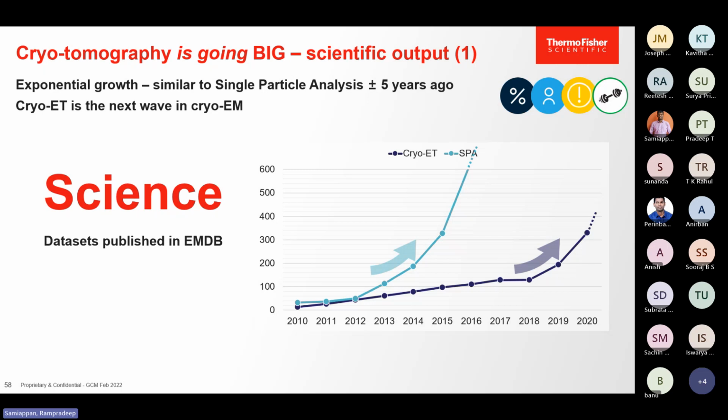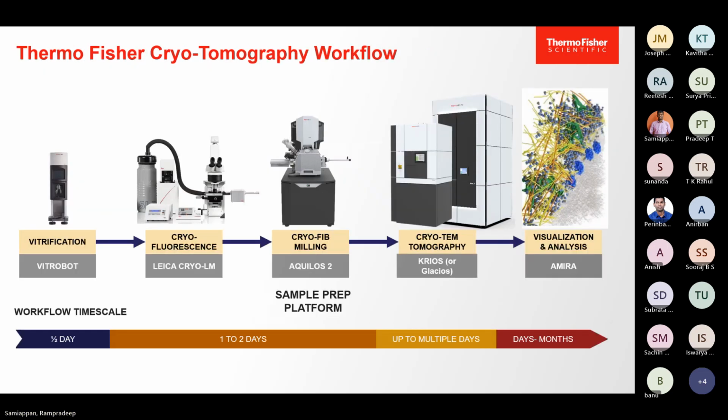The principle behind tomography is the same, but what's important over here is, once the sample is inserted and vitrified, you can see your sample of interest from different angles. And as you can see, recently cryo-ET has also picked up over SPA.